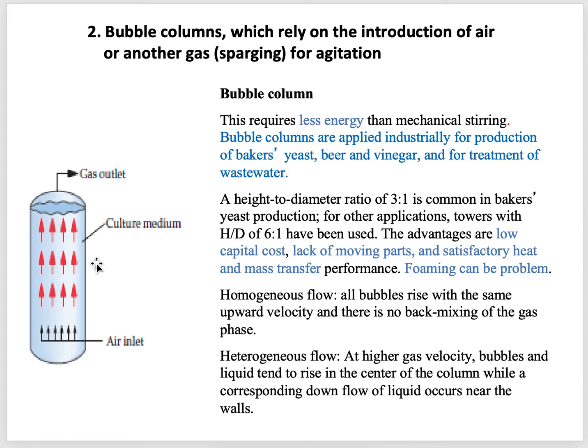In case of homogeneous flow, all bubbles rise with the same upward velocity. Actually, this photo represents the homogeneous flow. All the bubbles go up at the same velocity, and there is no back mixing of the gas here.